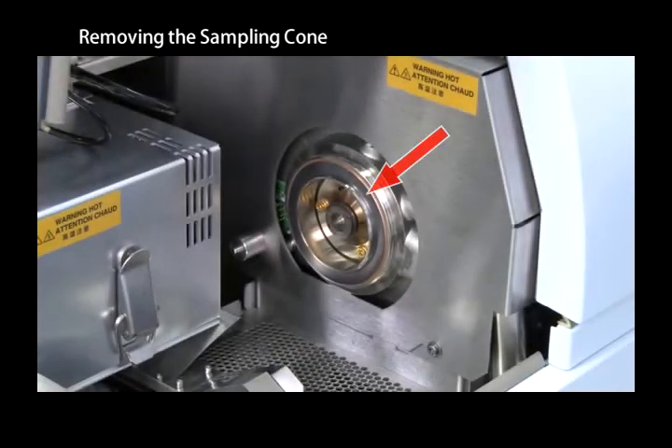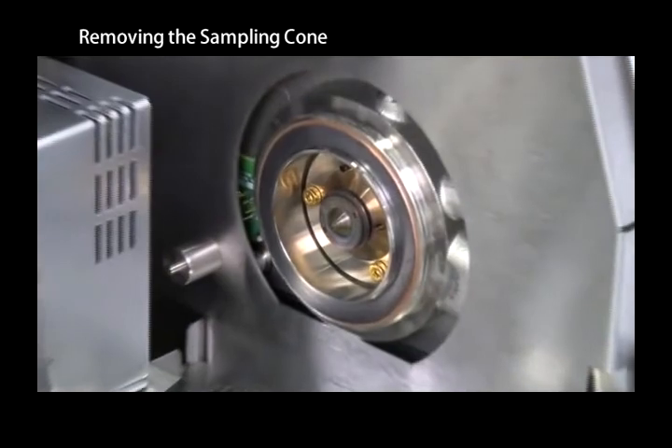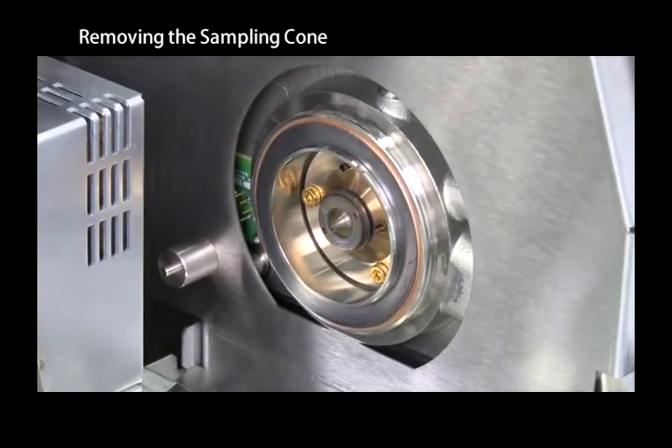Check the condition of the graphite gasket. Replace the graphite gasket if there are any fissures, creases, or other damage.